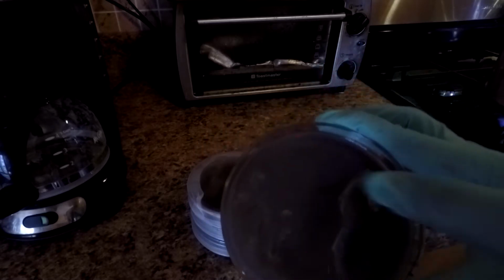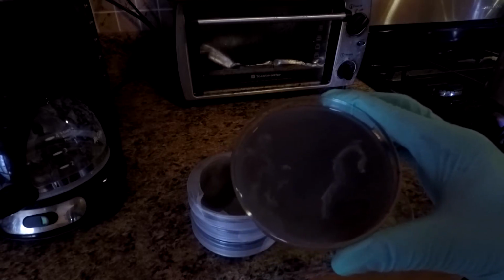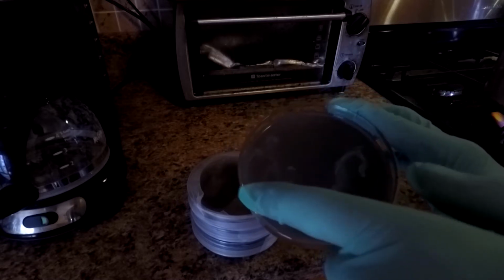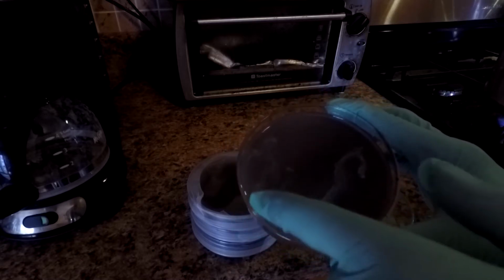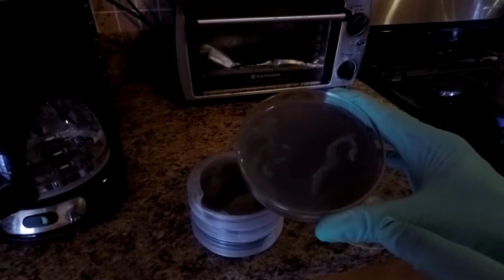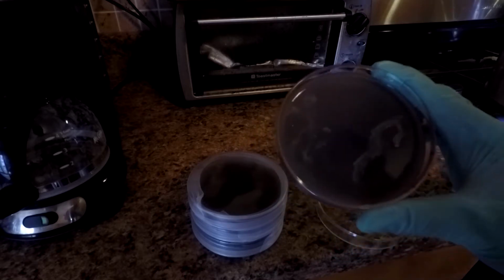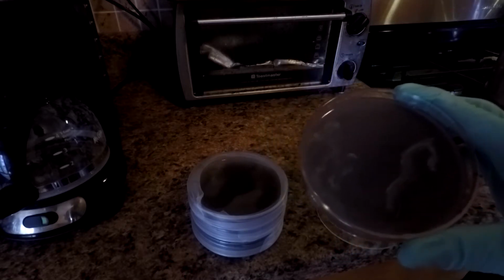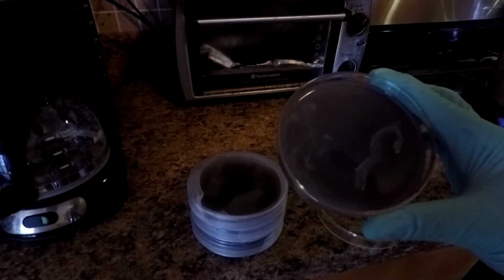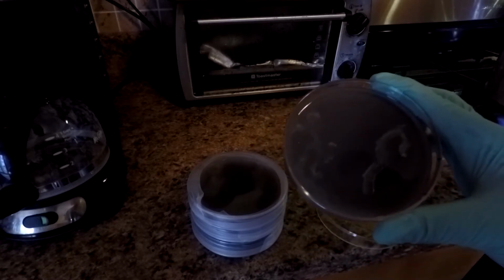If I had actually got some mycelial growth in any of this, I might do some tricks of transferring away the mycelium or pouring a very thin layer of hot agar over top of it all, which would kill the bacteria but allow the mushroom mycelium to live and grow up through it. There's a variety of ways to beat it out, but really what the problem is, I believe, is my spore syringes are just way too heavy with spores, way too thick with them.